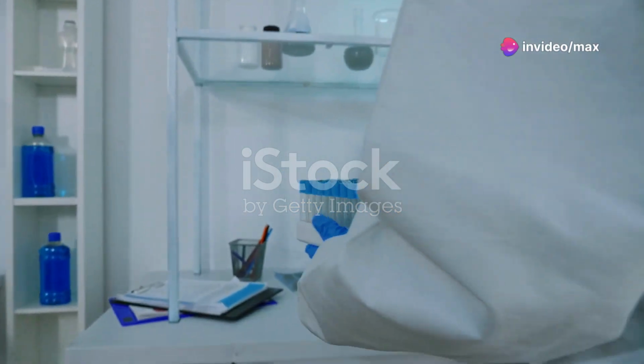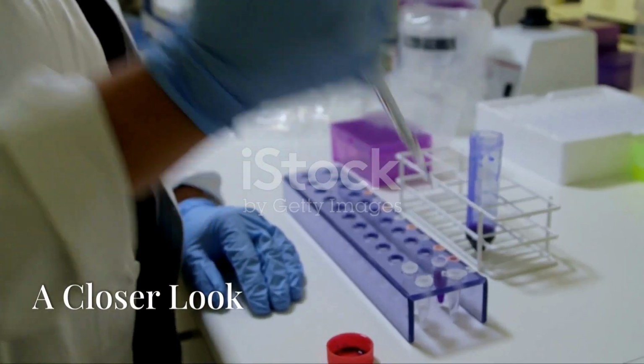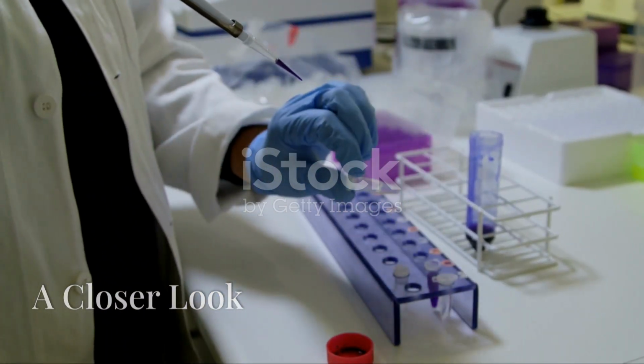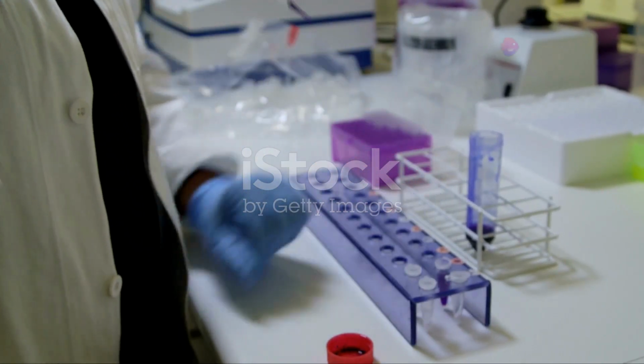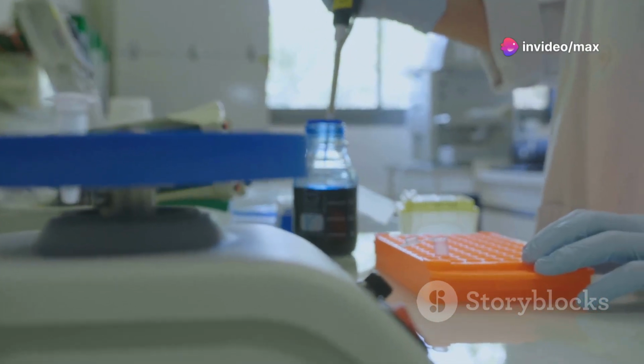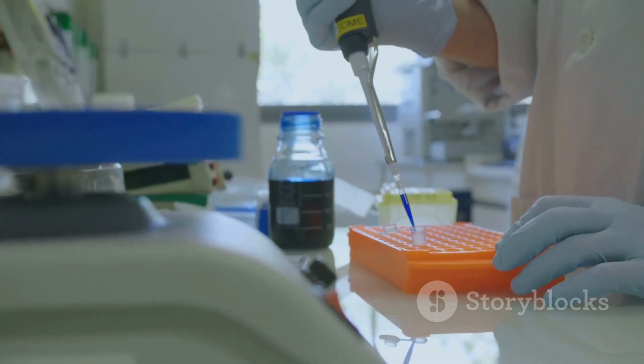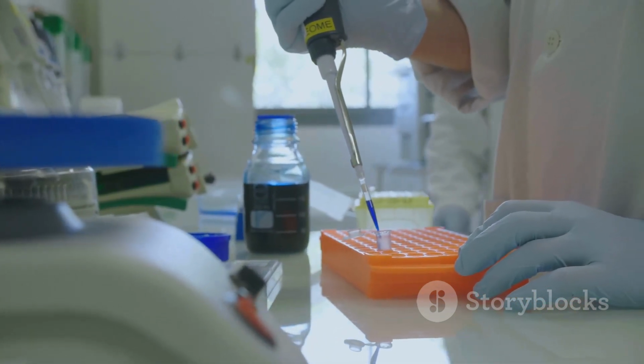Let's explore two of its most popular variations, direct ELISA and indirect ELISA. Direct ELISA involves an antigen being directly attached to the plate. Then, an enzyme-linked antibody specific to the antigen is applied. This method is quick and reduces cross-reactivity, but it might be less flexible.